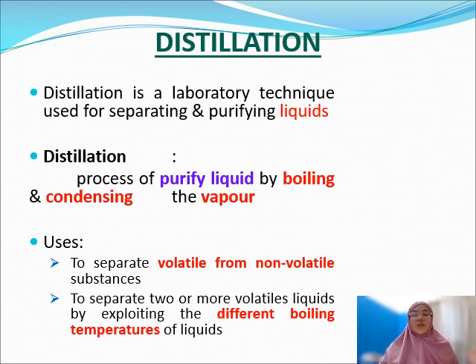The important objective of distillation is to separate and purify your liquids. Distillation involves the process of purifying, boiling and also condensing the vapor.